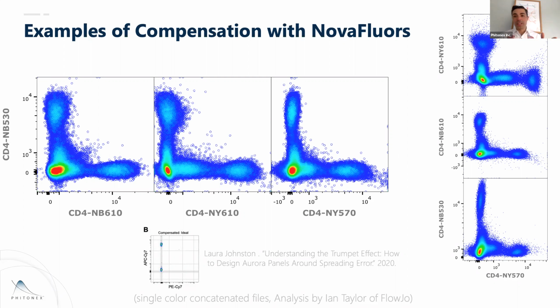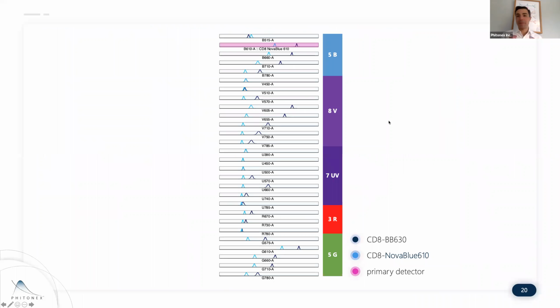And so we've also looked at this objectively, right? And said, okay, can we look at this across a set of labels? Can we look at this in terms of the quantitative notion of spread and look at how it affects other types of labels, right? And so no trumpet effect, which I can say here. Sometimes I have to explain it, but now I feel like I'm in home territory because you guys set the bar. So how do these labels compare to other things that are out there, right? And so for us, one of the things we do is a lot of benchmarking. So I'll show you some of the benchmarking that we've done.